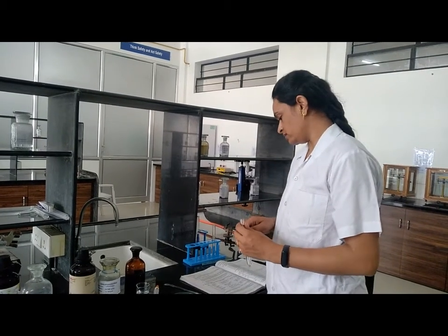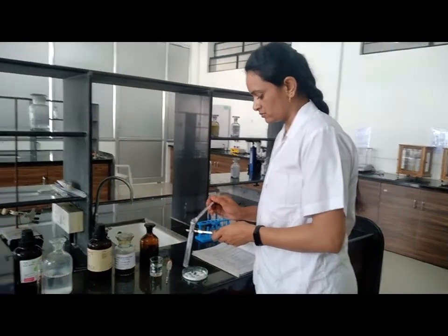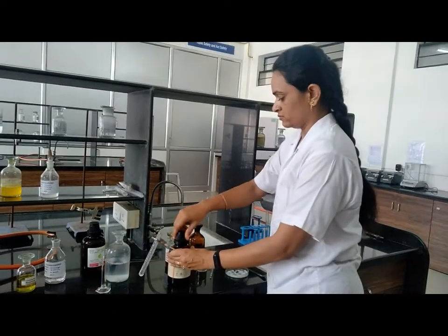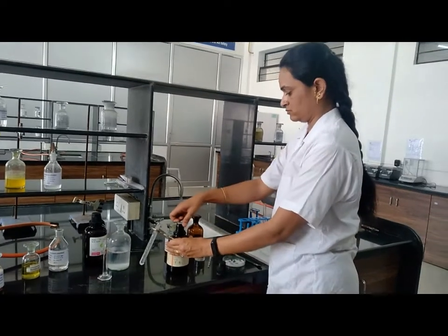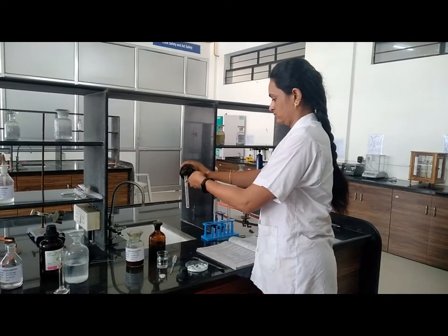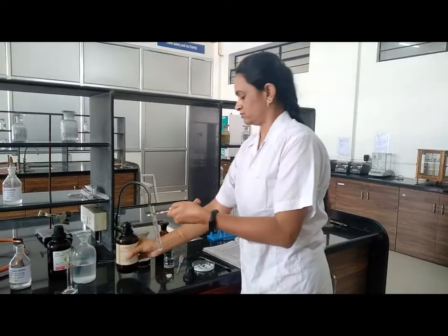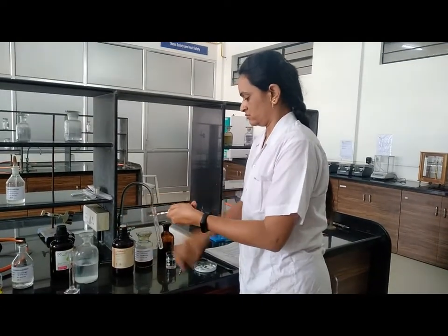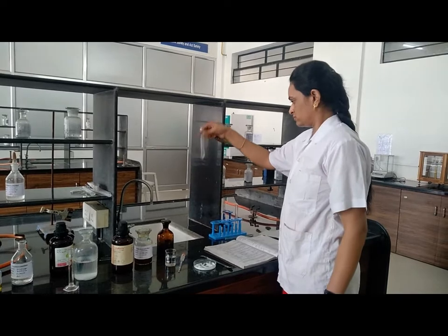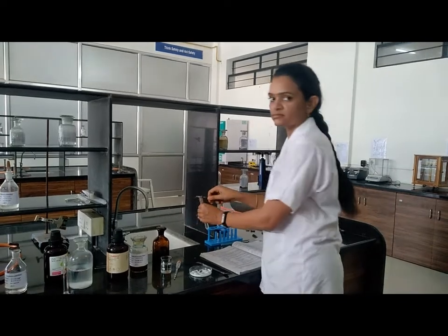Then check solubility in chloroform. Again take 1 to 2 milligram of sample and take solubility in ether. In ether it is soluble. Okay.